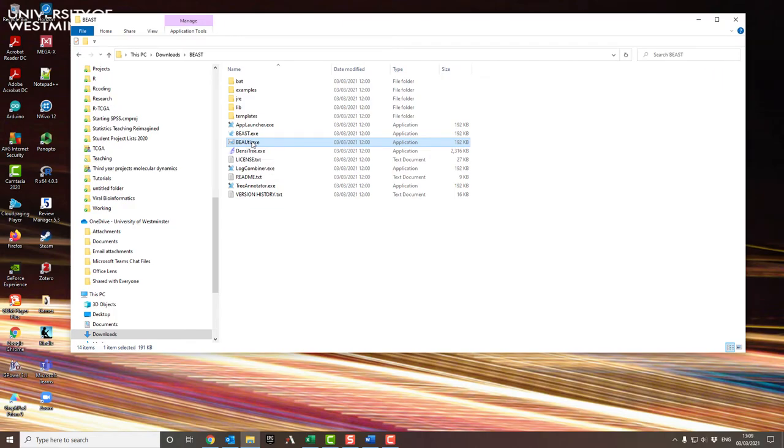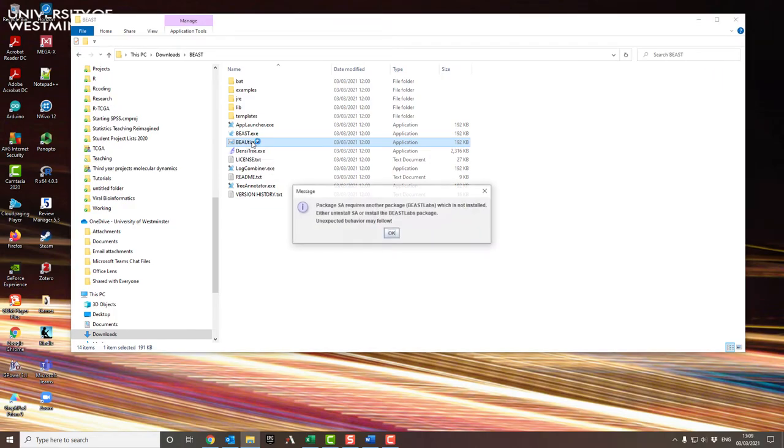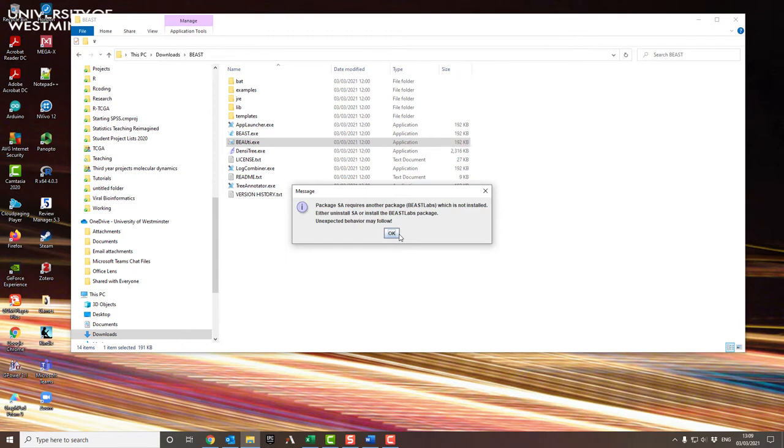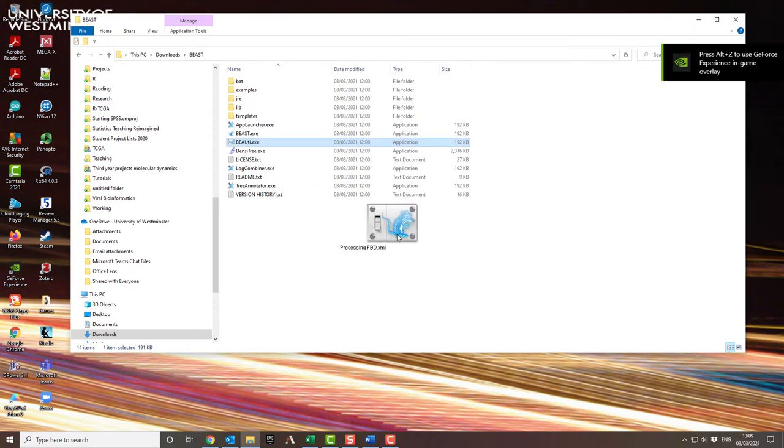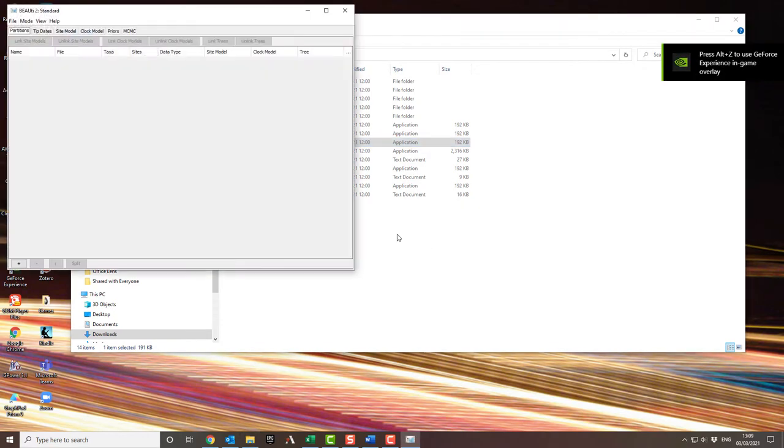In order to prepare your file for BEAST, the first thing you need to use is BEAUti. Now in this case, it's asking me about some packages which I need to install because I've got a slightly more advanced version than you will have. I've installed some extra packages for working on more complex models. You probably won't get that.